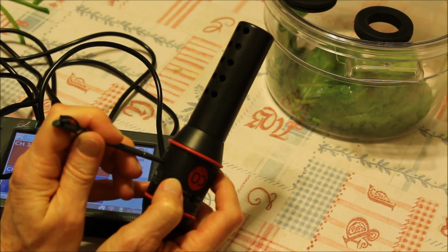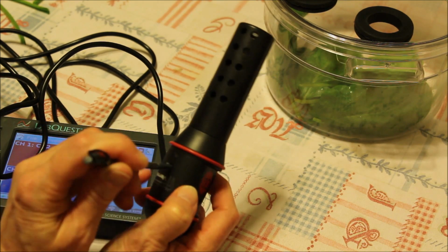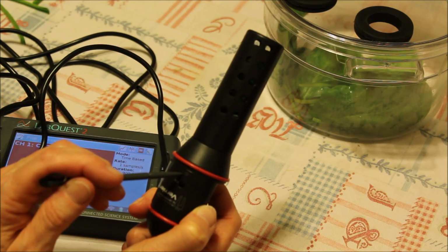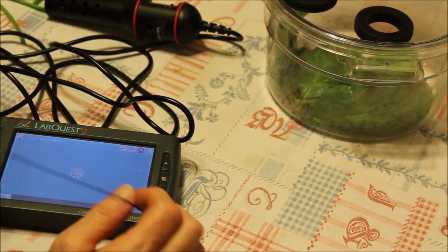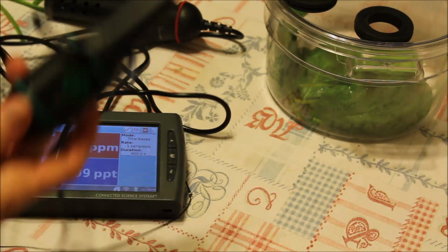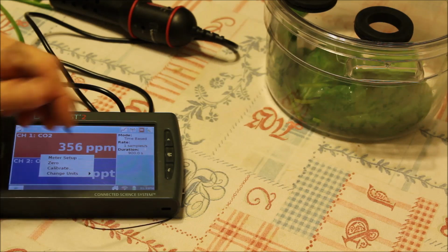You will press the calibration button. Doesn't want to pick up. Okay, you see it's just doing the flickering, the red. So it's around 400 for you. I don't know what happened. 400. And for the oxygen, whenever it just touches, it will just do it.